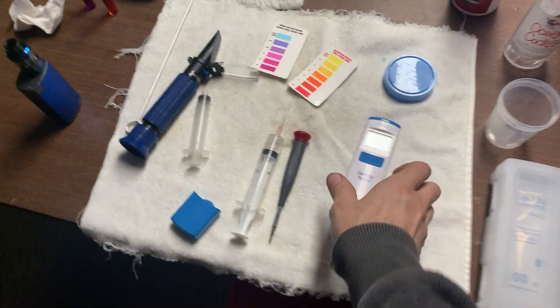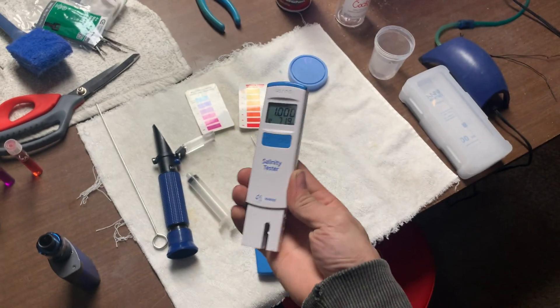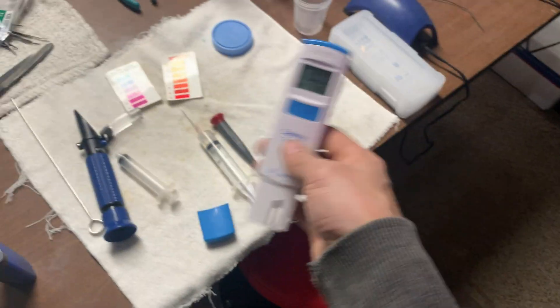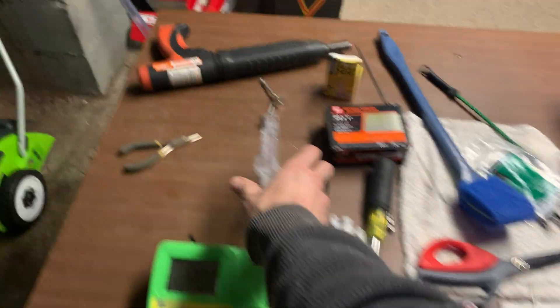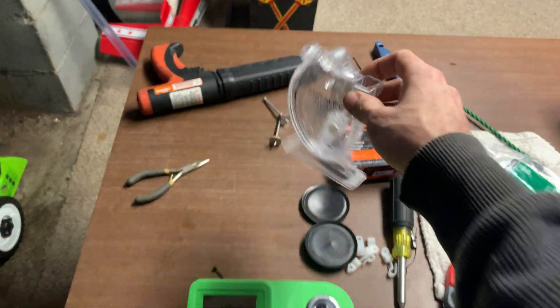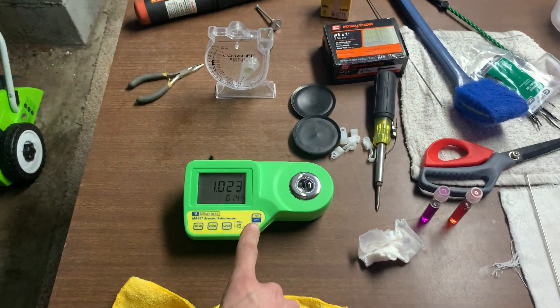I'm going to do a little video here. I recently purchased this Hanna Checker for salinity, and when I first got it, it was actually working spot on. Now I have a refractor, I have two hydrometers, and then I just recently bought this.